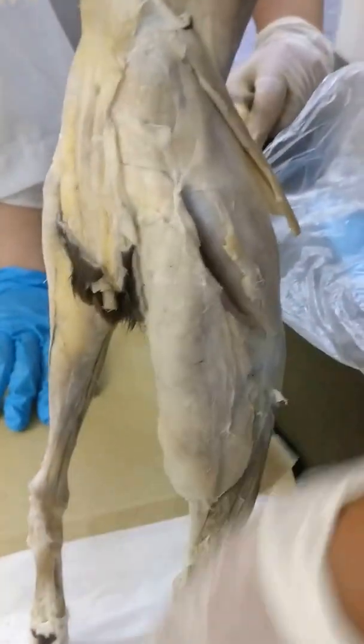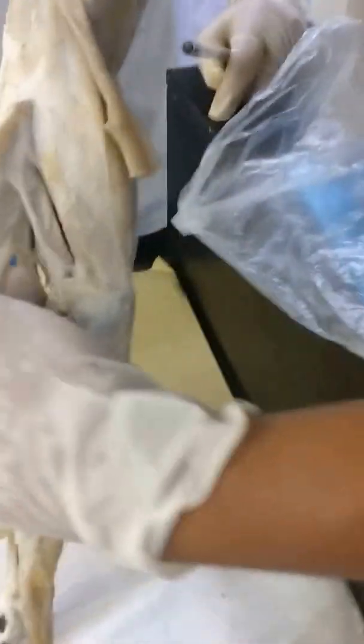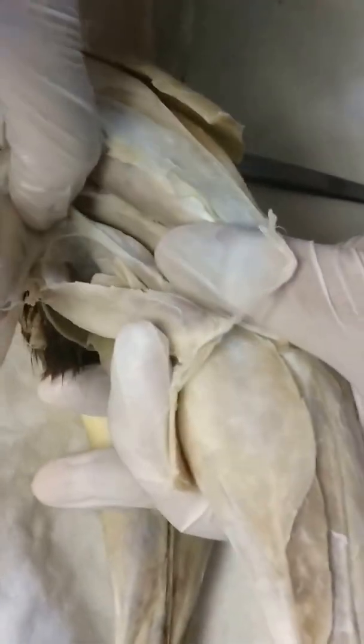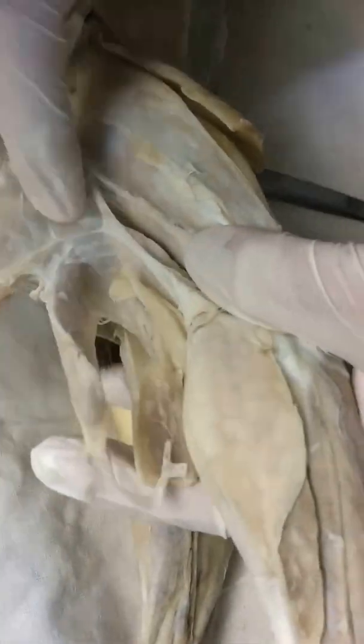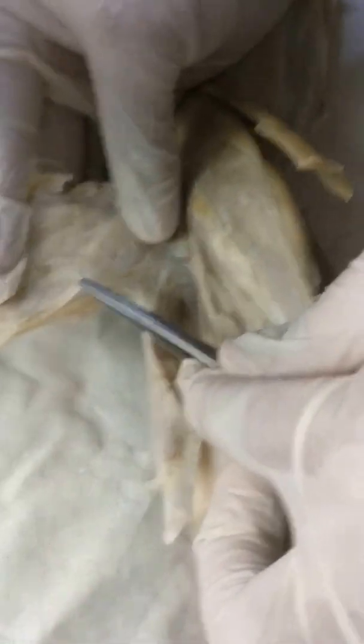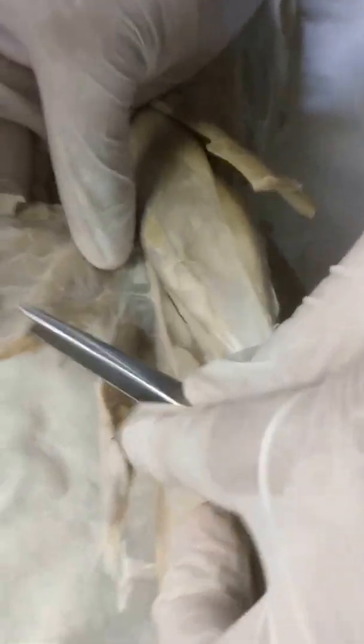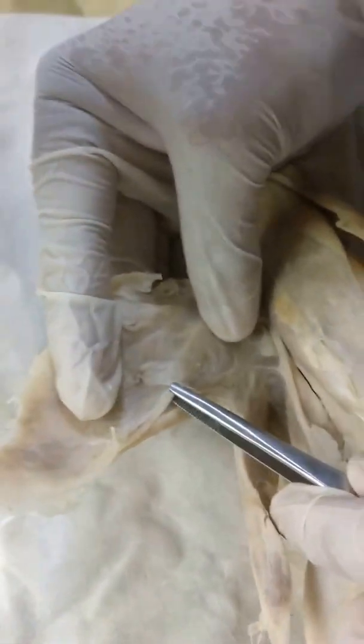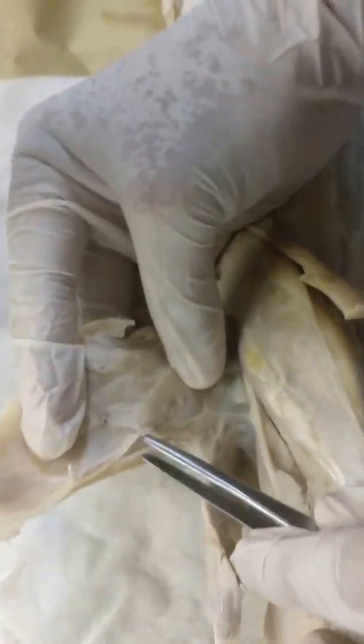You should deflect the biceps femoris. Then, on its inner surface, try to look for the tenuissimus muscle. It's very thin and strap-like. It is found underneath the biceps femoris. This is the tenuissimus muscle.